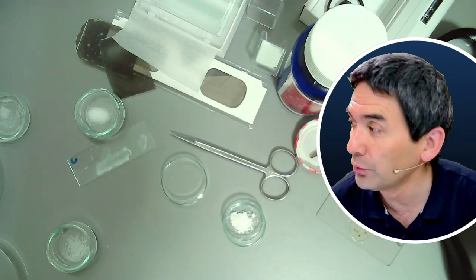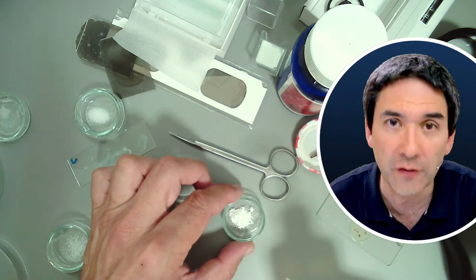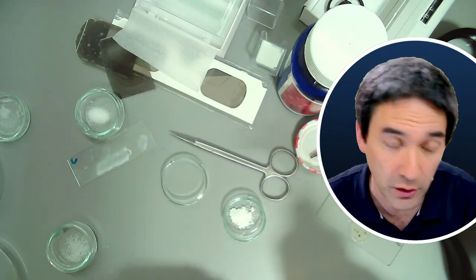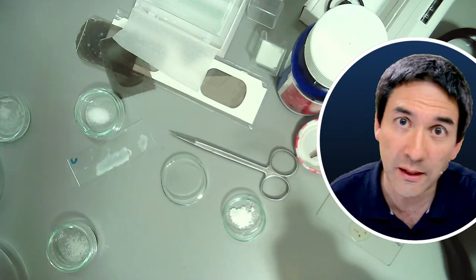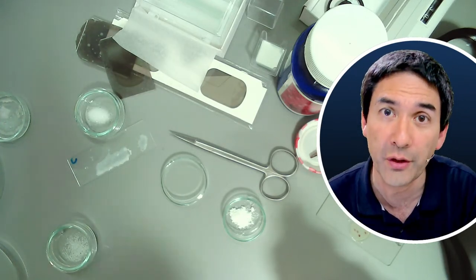And then what I'm going to do now is add a little bit of alcohol, because the caffeine dissolves well in alcohol. It also dissolves in water, but the alcohol has the advantage that it evaporates much faster and therefore we're able to see the crystal growth much better.